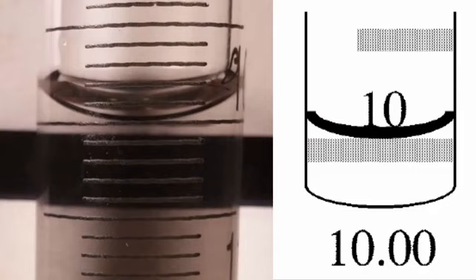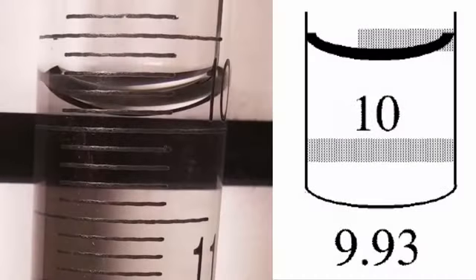In the next example, the meniscus sits at the top of the 10.00 marking, therefore the reading is 10.00. In the third example, the meniscus sits approximately half a line width below the 9.90 marking, therefore the reading is 9.93.